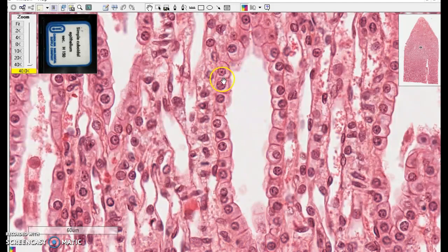It's got a nice round nucleus. It's got plenty of space and a moderate amount of cytoplasm around it.